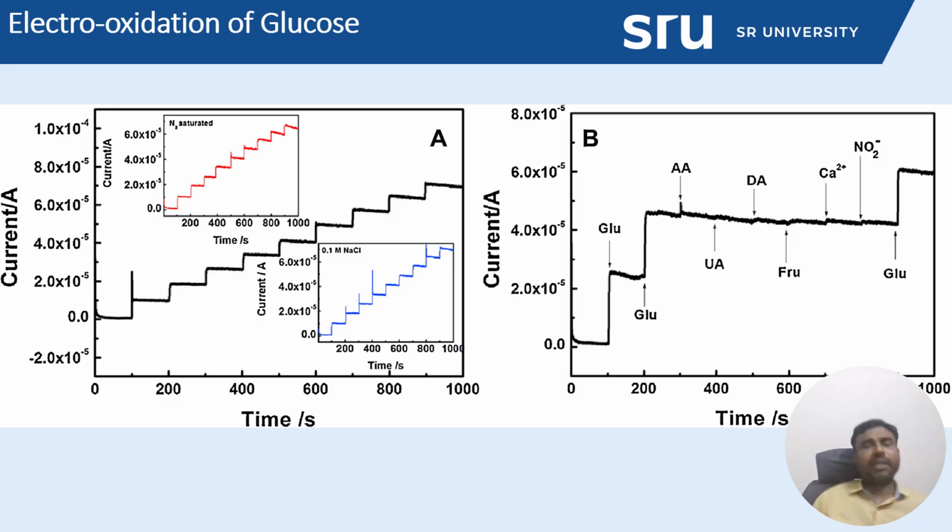So this means the fabricated copper sulfide modified electrode has good electrocatalytic as well as electrosensing properties towards the electrochemical non-enzymatic sensing of glucose. This is an important study to bring our fabricated material to the next level for real applications. Because in a real sample, there are different salts, small molecules, biomolecules, proteins and lipids. There are n number of molecules contained in a real blood or urine sample.